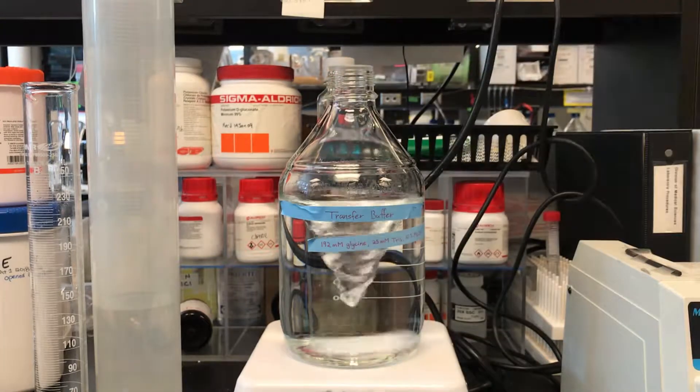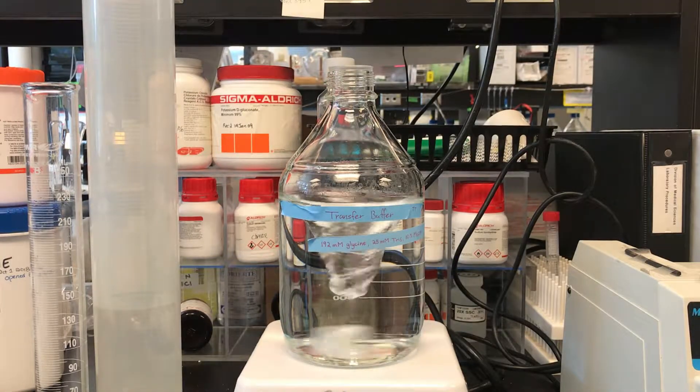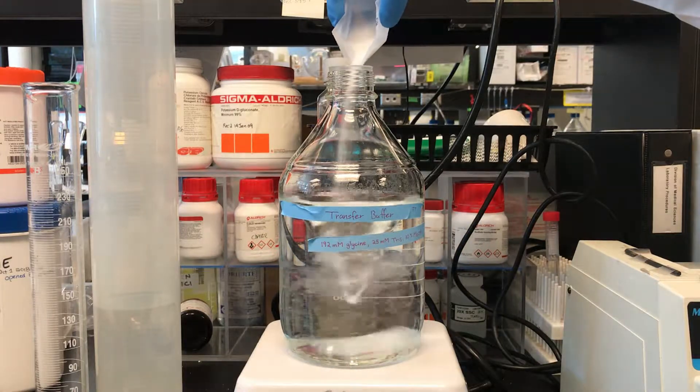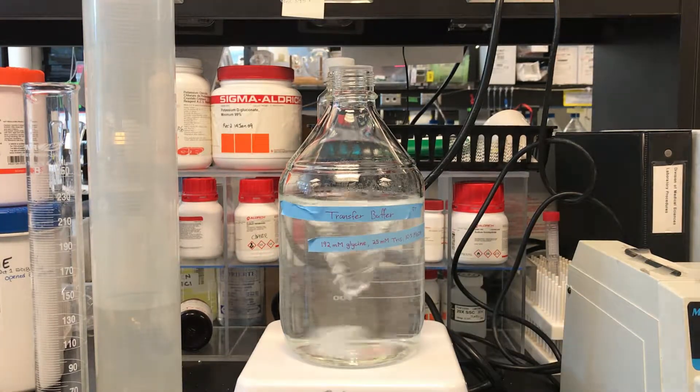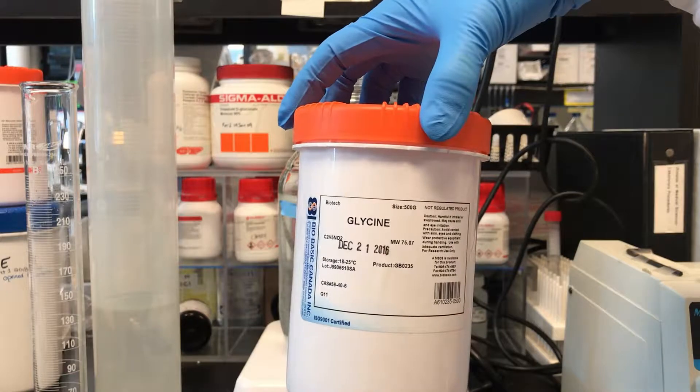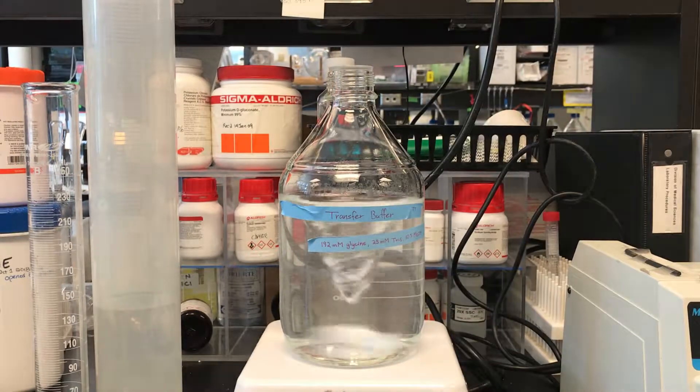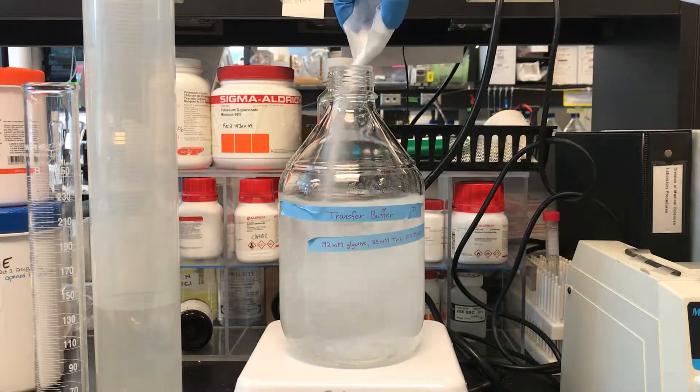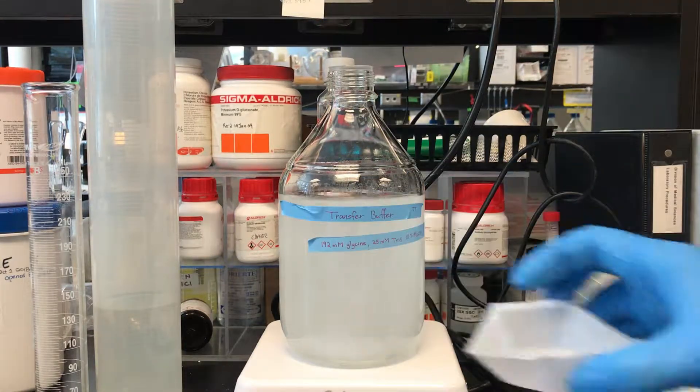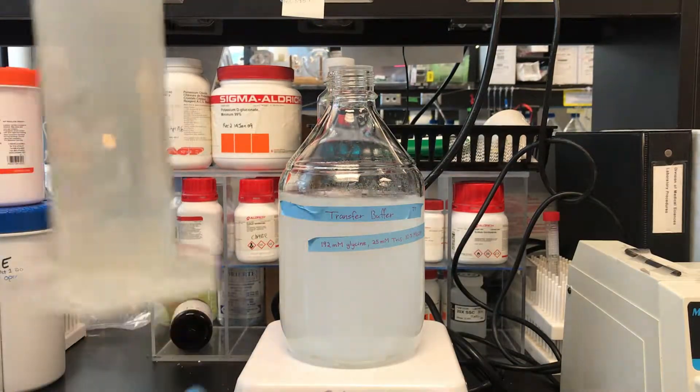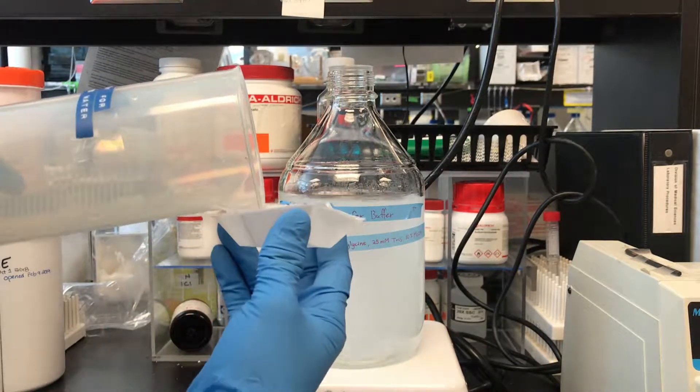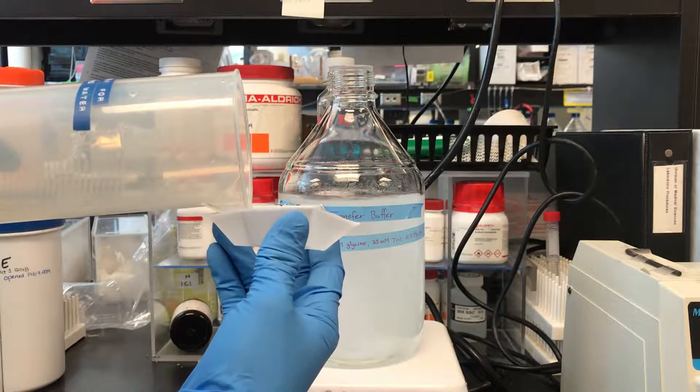Then add 6.06g of Tris base. Flush the weight boats with the distilled water until no remnants are present.